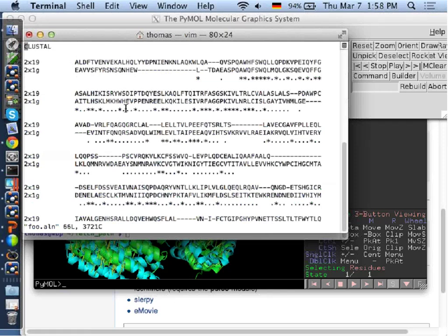Okay, other questions? Yeah, sure. But these have only 28% sequence identity. They have many gaps. The morphing will look crappy. It's a natural problem. You can't morph an apple into a banana.